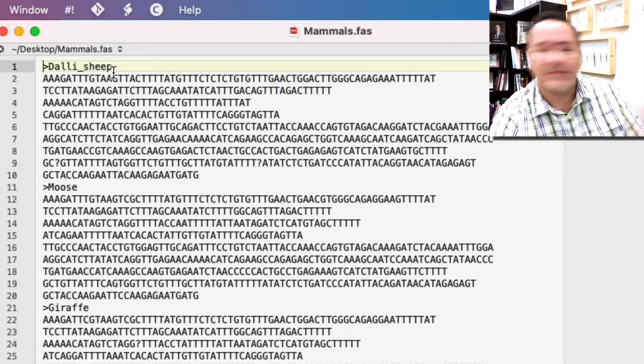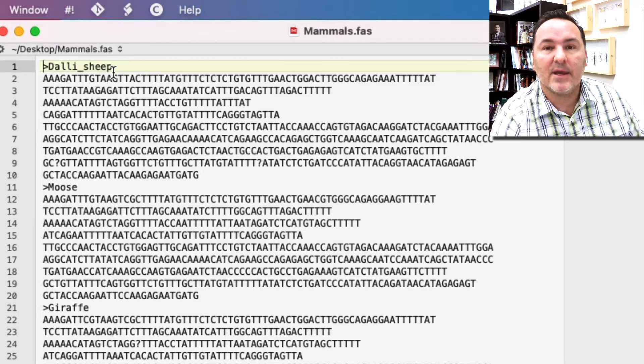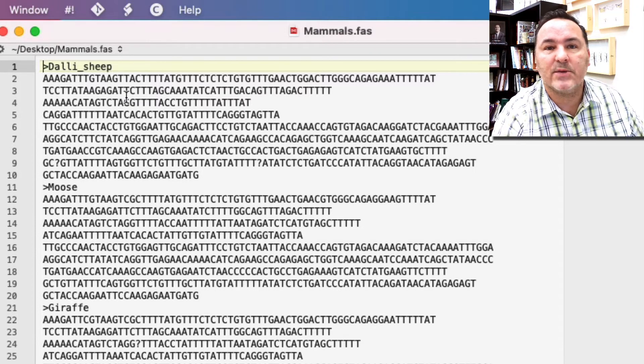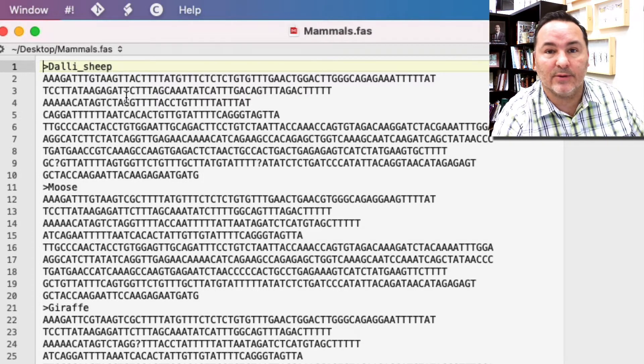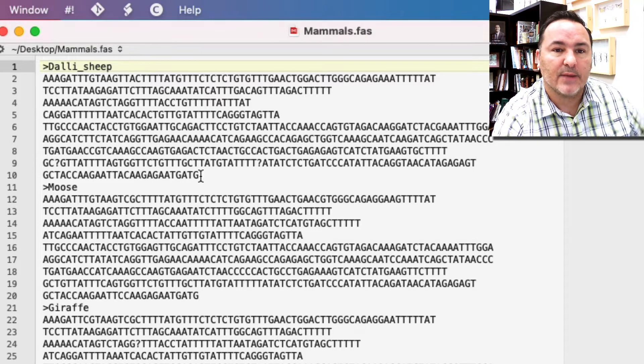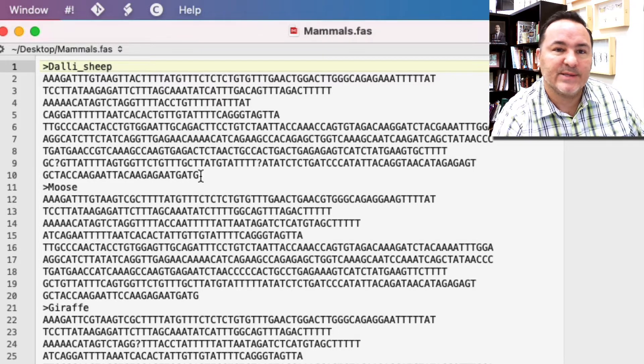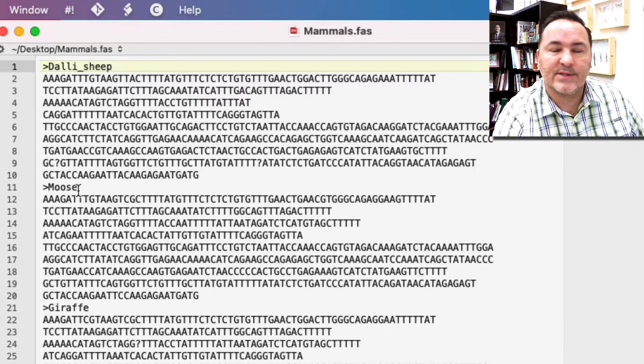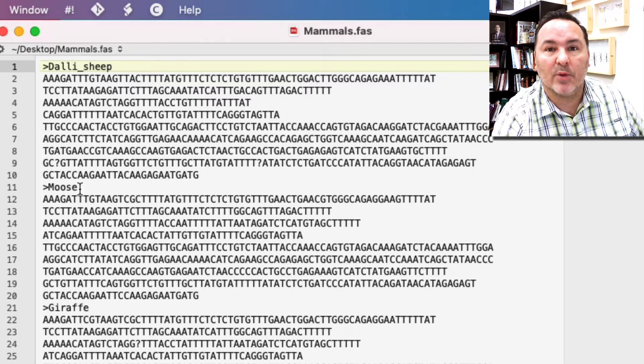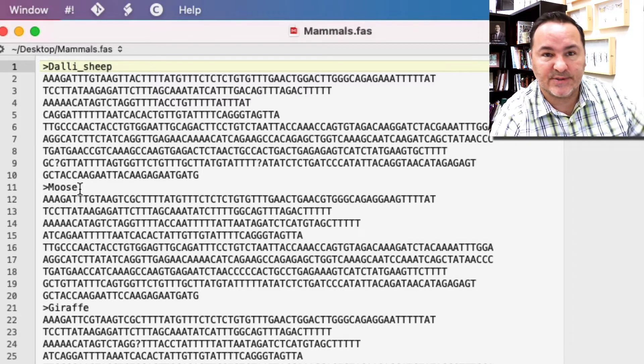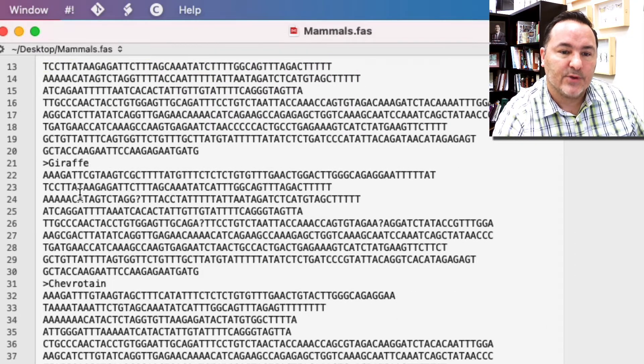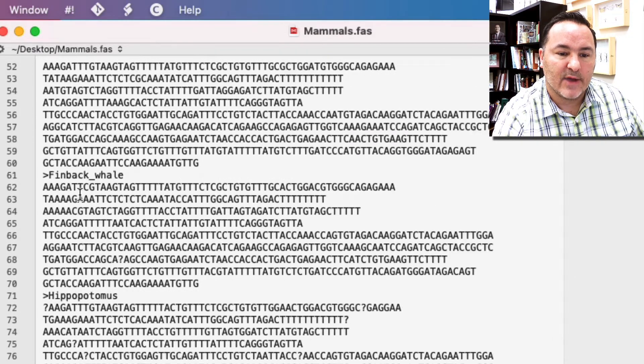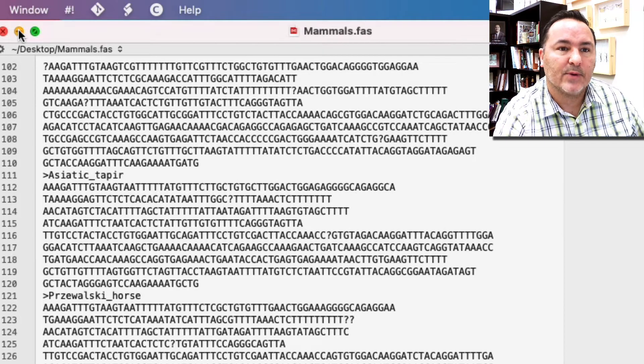I would encourage you to use either common names or the scientific names, but get rid of all of the other stuff that maybe comes with the sequence when you export it or download it out of GenBank from NCBI. Make it names that are usable because those are the names that are going to be on the tips of the tree. You can see here I've got this data set of mammals.